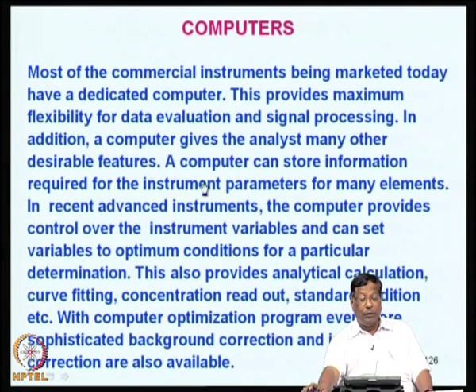Suppose you want to determine copper, then you just press copper on the periodic table. It will open up a file which will tell you what type of flame is to be used, what is the wavelength, what is the slit width, etc. What is the Beer-Lambert's law range, what is the linearity, what should be the flame temperature, what should be the gas flow rate, like that.